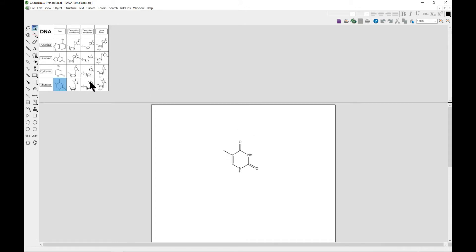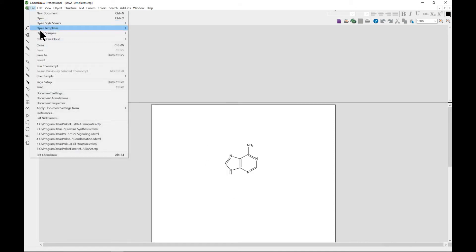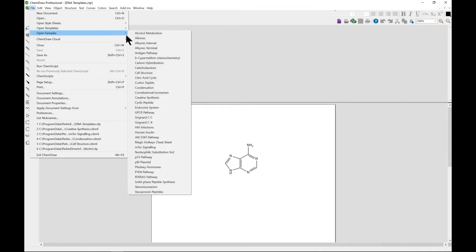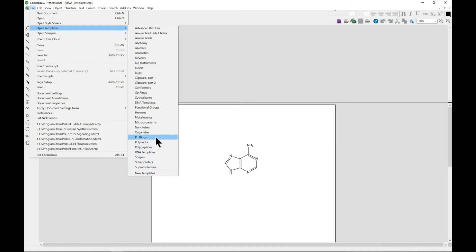You don't have to draw it from scratch. It already gives you this template and you can play around with that. You can also come in and play around with some of these and see which one you need.